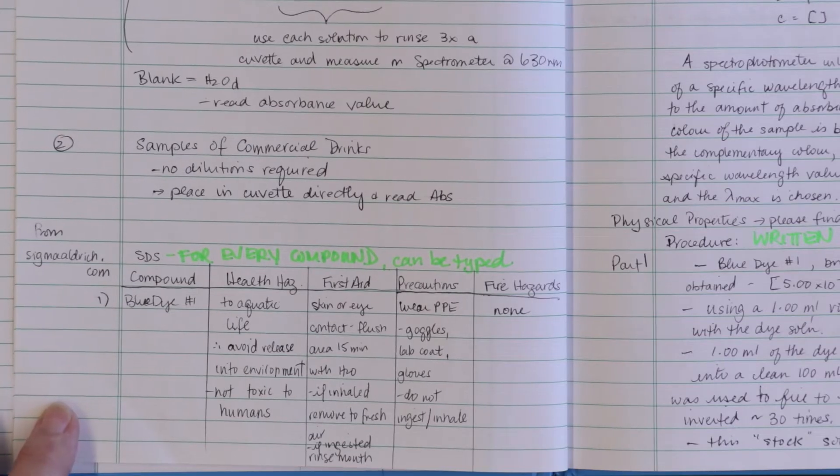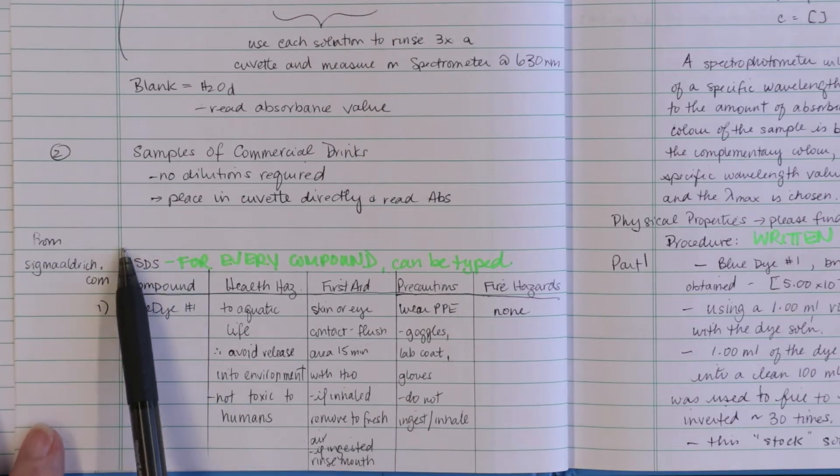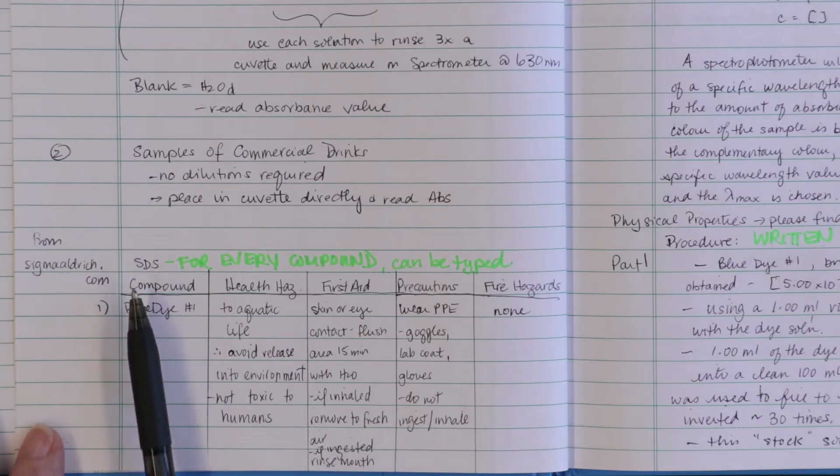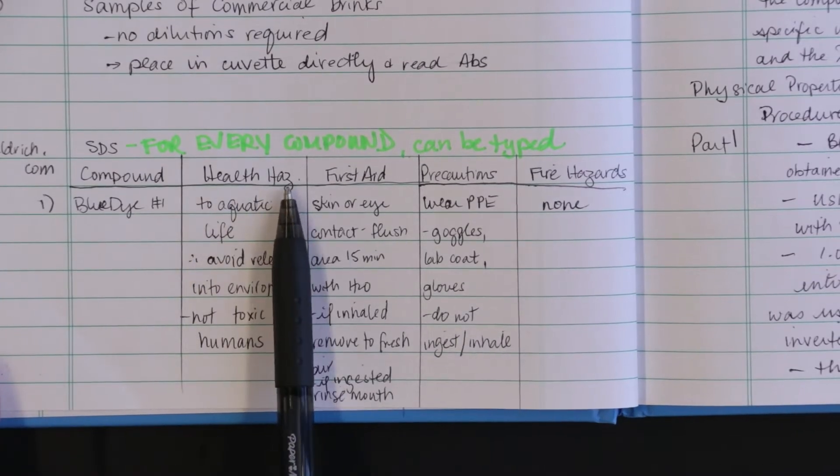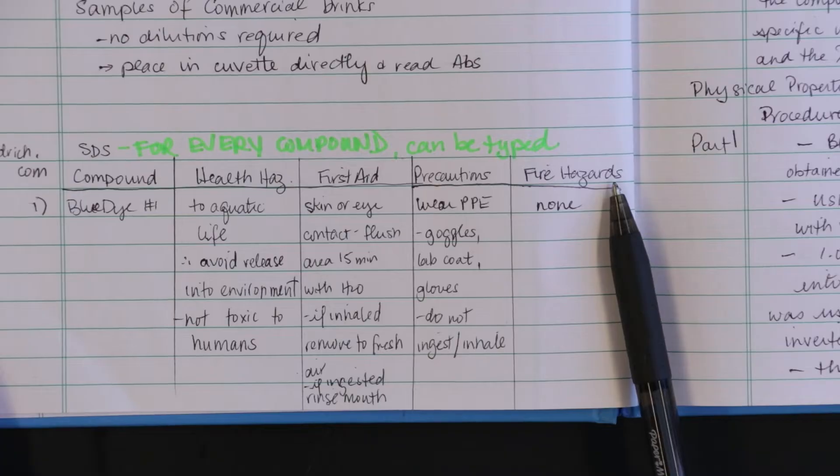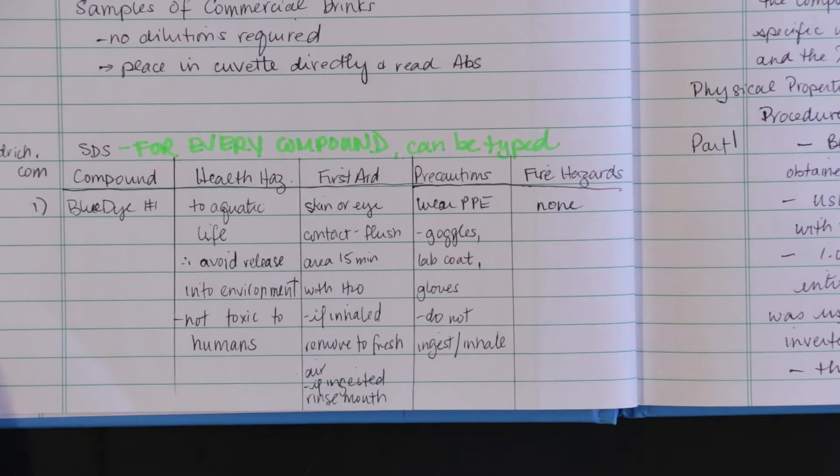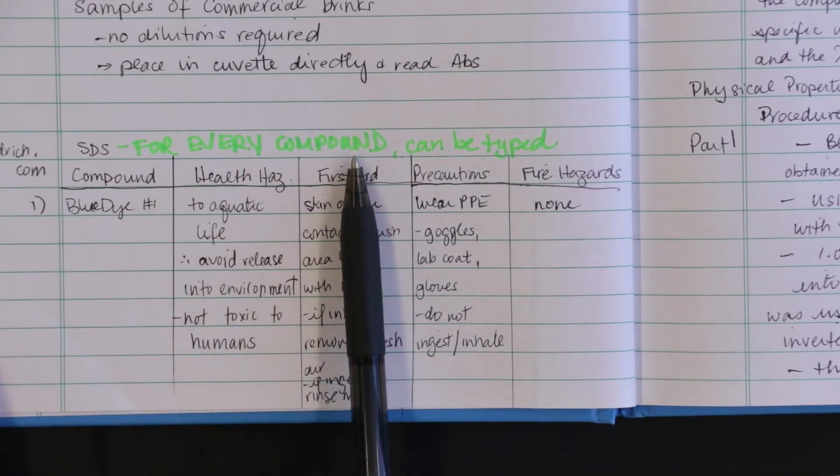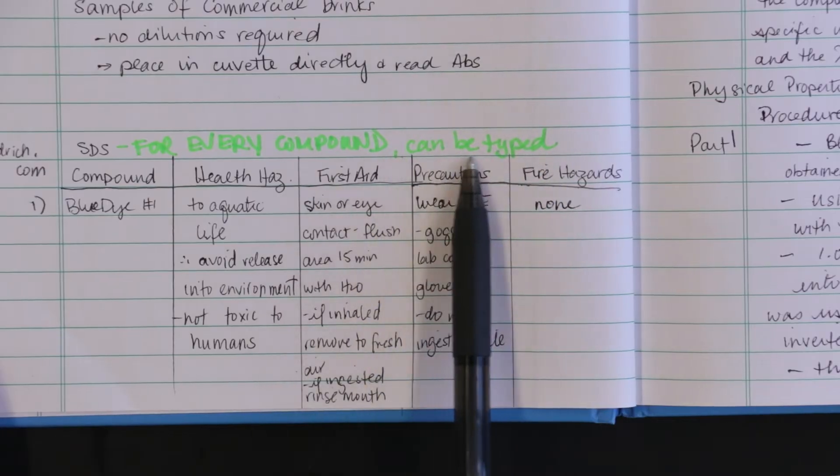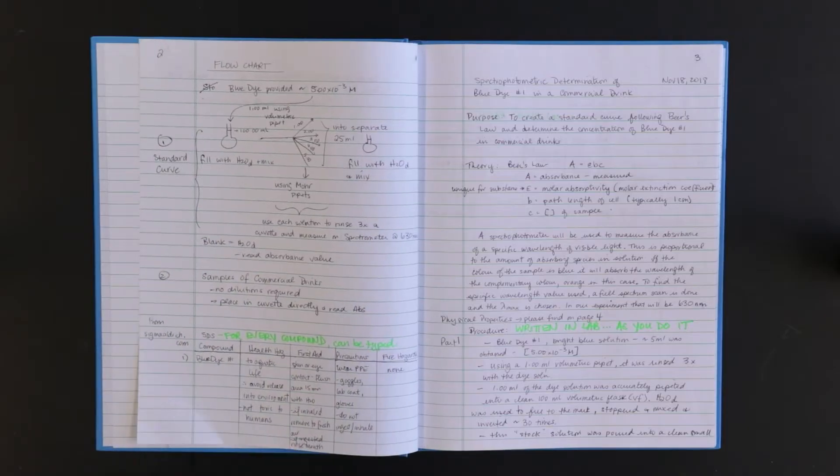You will need a chart of hazards for every chemical you will be using or making in this experiment. This is called the SDS, the safety data sheet information. The chemical, health hazards, first aid precautions, fire hazards are all included and whether it is an oxidizing or reducing agent or flammable. All this information can be found in the chemical safety data sheets found online that are specific for each chemical. Your manual will have more information on this. Every compound requires it and it can be typed and glued or taped into your notebook or handwritten. Always state your reference, in this case sigmaaldrich.com.